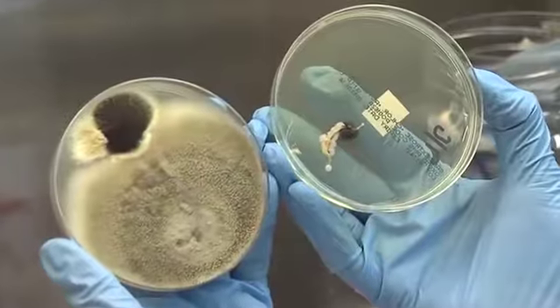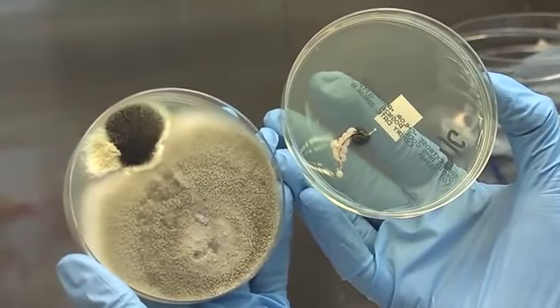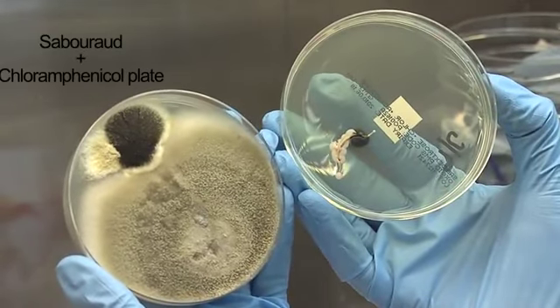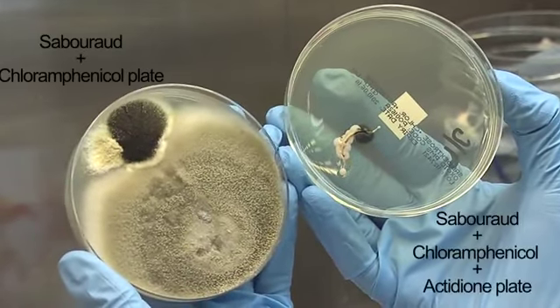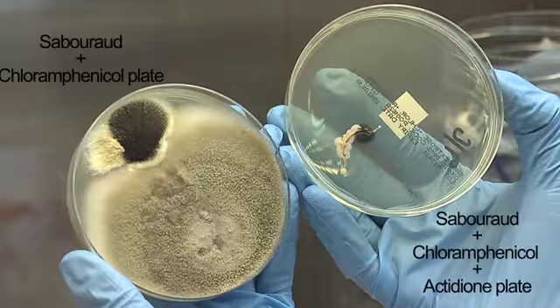These culture plates on another sample show growth of 2 spreading colonies on the Sabouraud plus chloramphenicol plate, but no growth on the Sabouraud plus chloramphenicol plus actidione plate. Thus, this indicates that this growth is not a dermatophyte and is most likely an environmental contaminant or a non-dermatophyte, of which there are a few that can cause superficial skin infections.